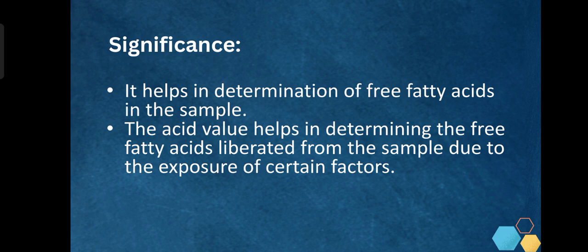Next is the significance of acid value. So this helps in determining the amount of free fatty acids in the sample or in the fats or oils, which is formed due to exposure to certain factors. The factors can be air, moisture, enzymes, etc. We have seen the reaction of fats and oils.